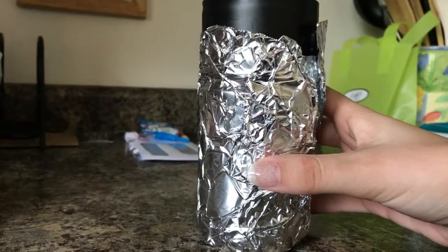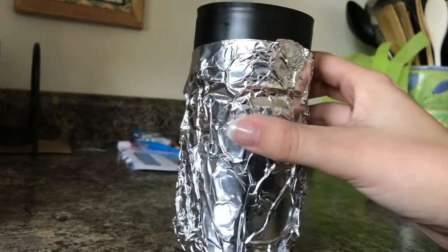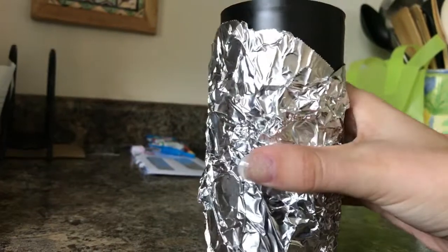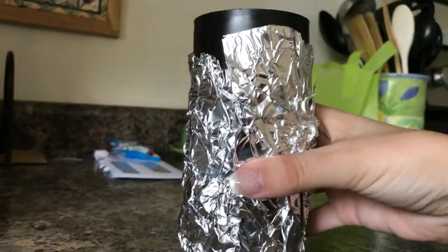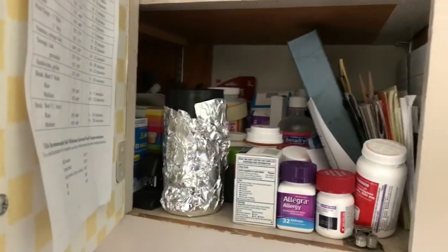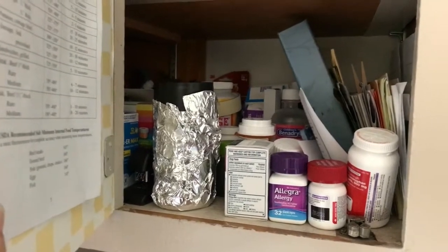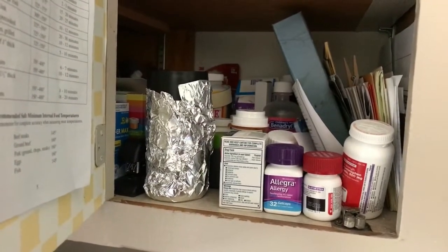Now that we've completed the dissolved oxygen test, we stored the water in the fleeker and wrapped it completely in tin foil, just to make sure that it stays as dark as possible. We're going to be putting it in a cupboard for five days, and then after that we'll come back and do the dissolved oxygen test again to see the difference between the two days.